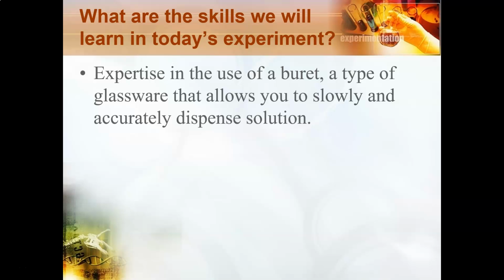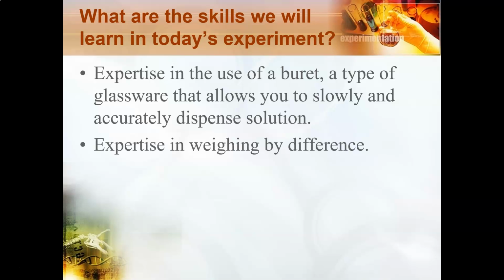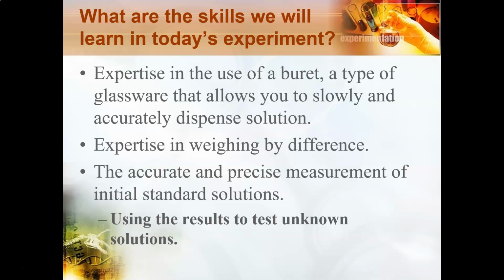Well, we are going to acquire expertise in the use of a buret, which is a type of glassware that allows you to slowly and accurately dispense a solution. We will get expertise in weighing by difference. You have watched us do that on the video, but I don't think you've done it yourself. So you'll get expertise in weighing by difference, and you'll get expertise in the accurate and precise measurement of initial standard solutions. And then we'll use this information to figure out the concentration of an unknown solution.